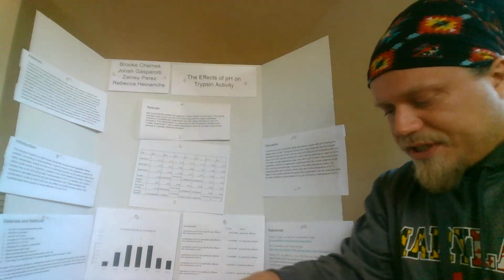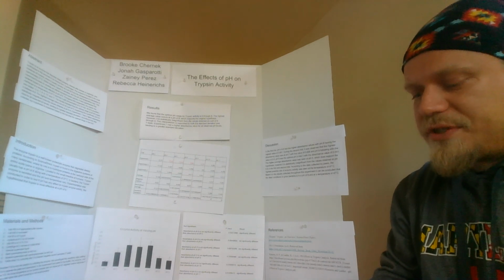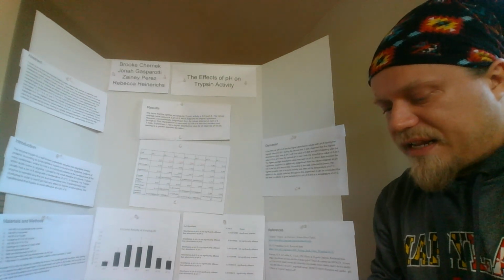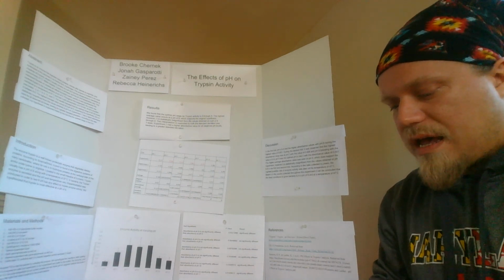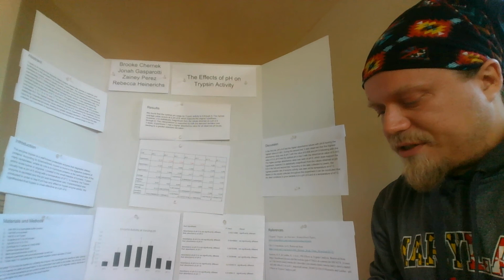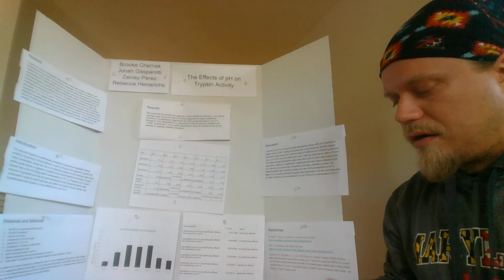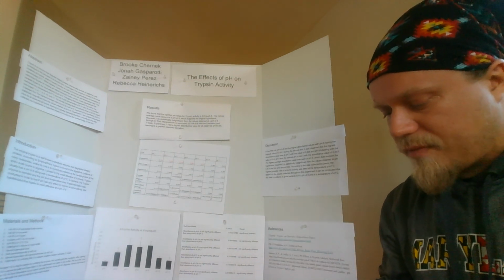For the experimental procedure, the salt buffer was first added, then the azocasein, then the trypsin. This was then incubated again at 47 degrees Celsius for 20 minutes, and TCA was added to stop the reaction. This was then centrifuged, removing the undigested protein in the pellet, and the supernatant contained all of the digested protein.